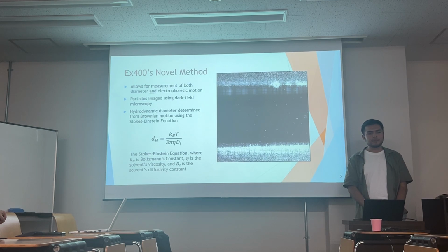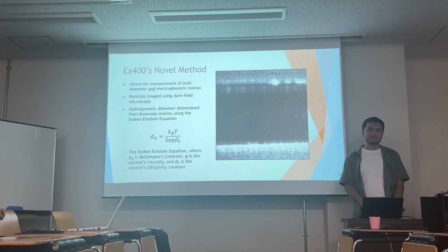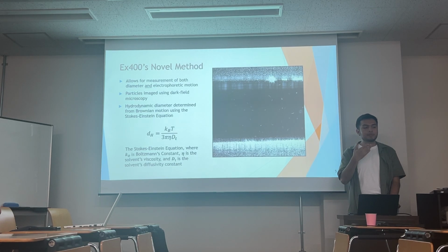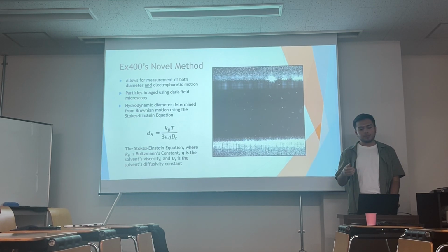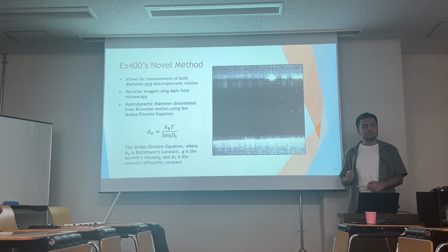Yeah. So the EX400, it's a very fancy machine, honestly. It can be difficult to understand how to use it at first. I think it comes with the nature of developing new machines. At first, you're focusing more on having the machine actually work instead of designing maybe a friendly interface.